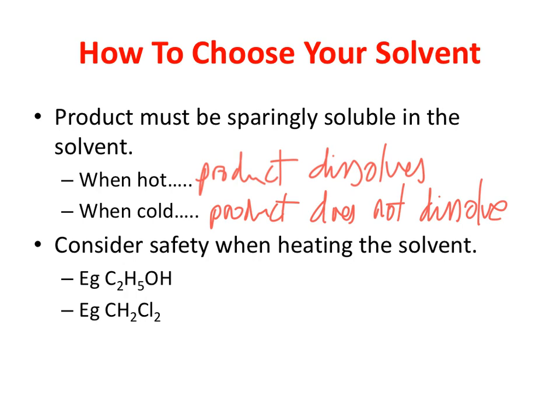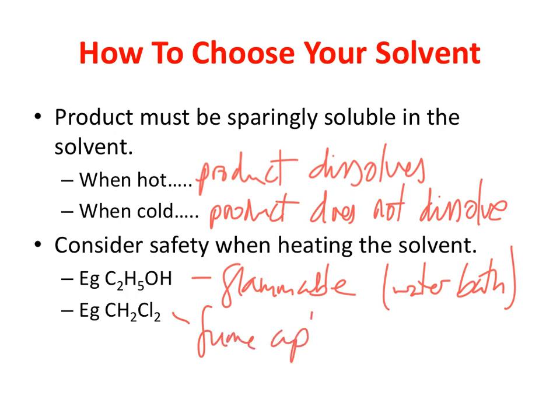We also need to consider safety matters when heating the solvent. This substance here is ethanol. So, you don't want to be heating ethanol over a Bunsen flame because it's flammable. So, you'll need to use a water bath to heat it and taking the water from a kettle, maybe. This substance here is dichloromethane. Now, that's a toxic substance. You don't want to be heating dichloromethane in the laboratory. Certainly in the open laboratory. So, you might want to use a fume cupboard if the solvent is toxic.